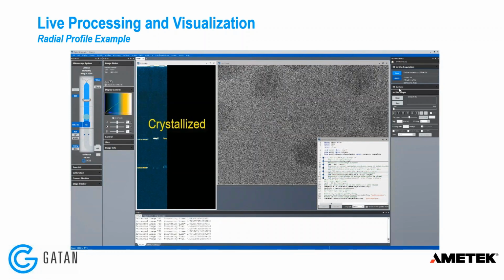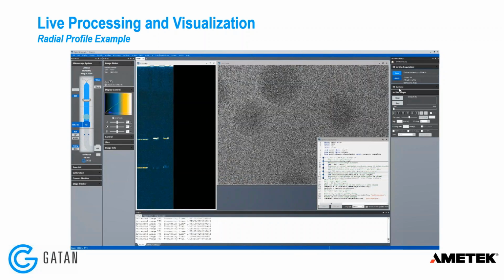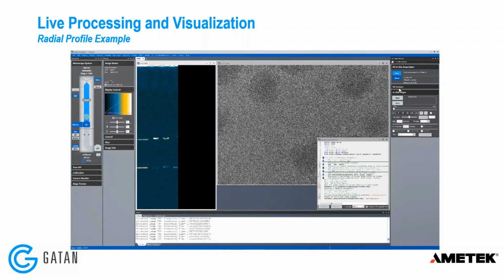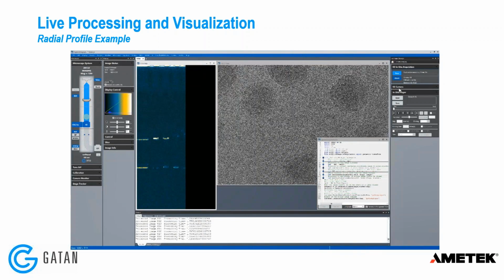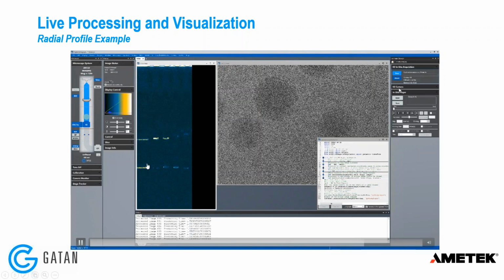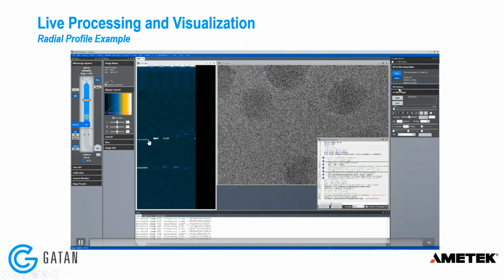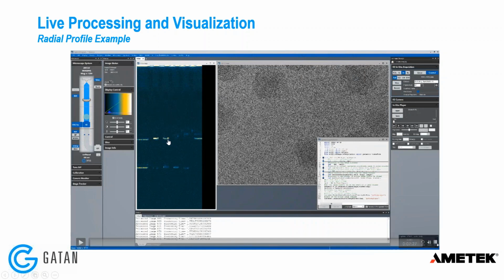And I'm again recording a nanoparticle sample as I heat and cool the sample. And this is tin, and it actually melts and recrystallizes as I heat and cool the sample repeatedly. And we can see from this profile that's being plotted over time, I can see exactly when the nanoparticles melted and recrystallized and melted and recrystallized over and over again. And this makes it very easy to follow the dynamics of what happened in my experiment.